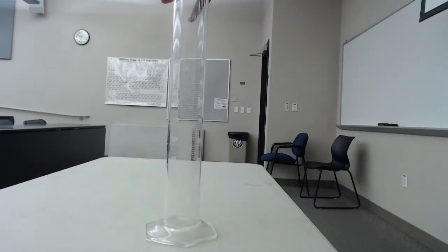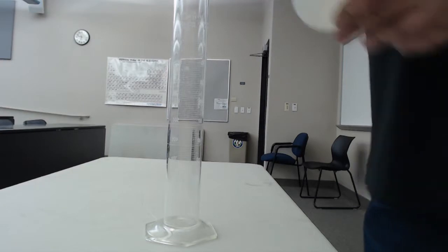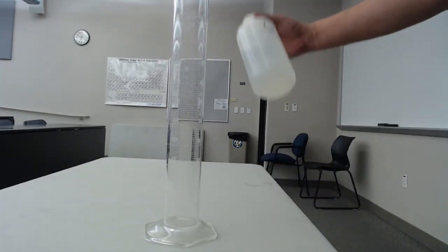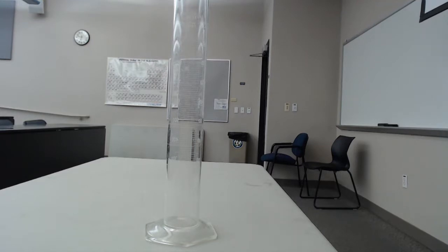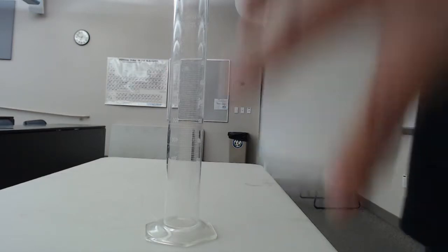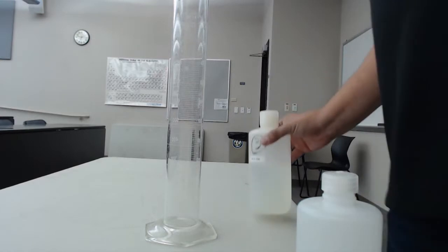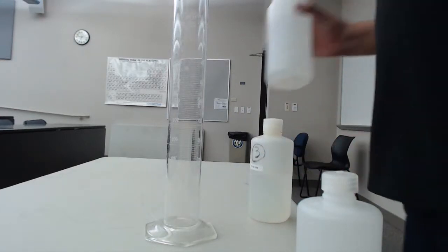We're doing a little bit of acid-base chemistry. We don't have a lab in here, so I want you guys to get an idea of the kind of things that we see in lab. Today I have some hydrochloric acid - we did go over how to name these, right? And then here I have some saturated sodium carbonate, a base. So one of them is an acid, one of them is a base, then I have water.